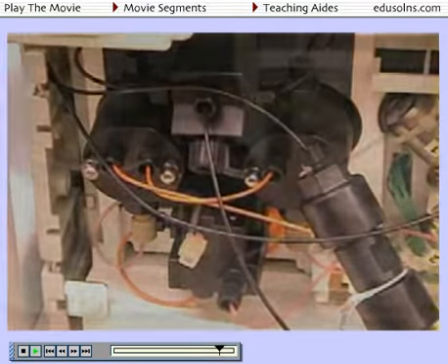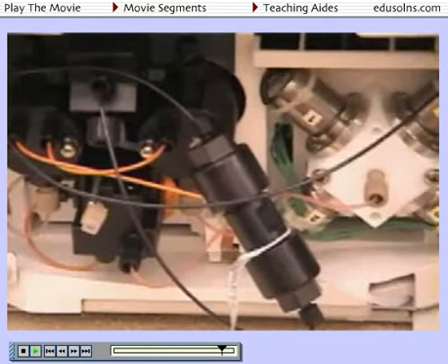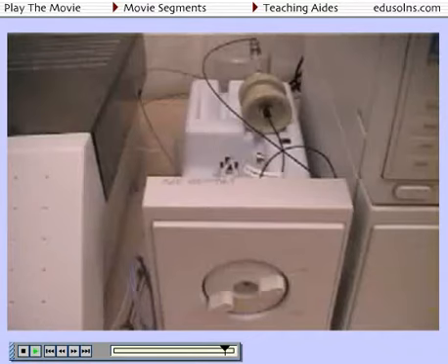After flow exits the pump, it enters a gradient mixer that ensures that the mobile phase is completely mixed. Next, the flow travels to the 6-port valve and injector assembly. The valve is either in the load position, where samples are loaded into the sample chamber, or in the inject position, where the mobile phase enters the sample loop and forces the sample onto the guard column.